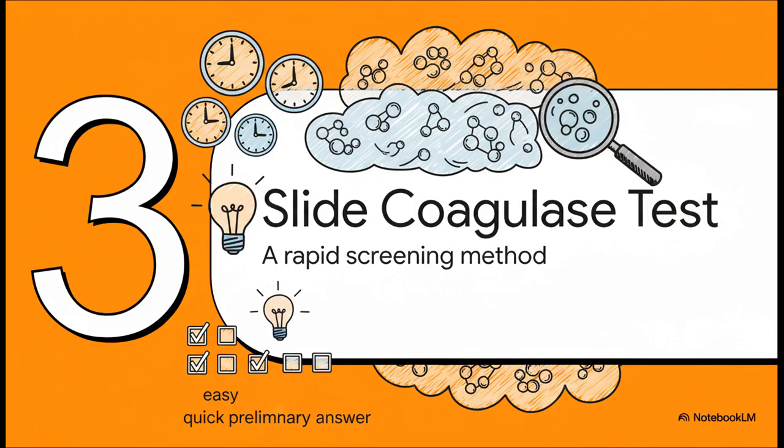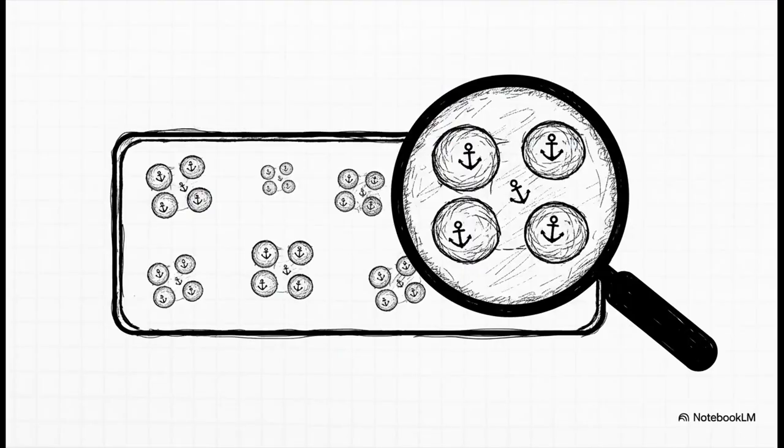So that brings us to our first method, the slide coagulase test. The best way to think about this one is as our rapid screening tool. It's fast, it's easy, and it gives us a quick preliminary answer. And what is it looking for specifically? It's designed to detect that bound coagulase, the clumping factor that's stuck right on the surface of the bacteria.